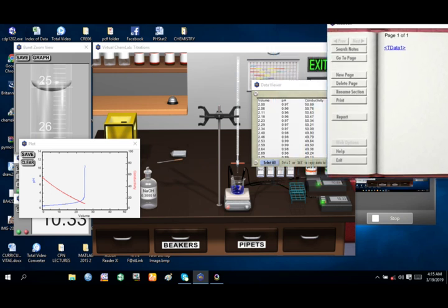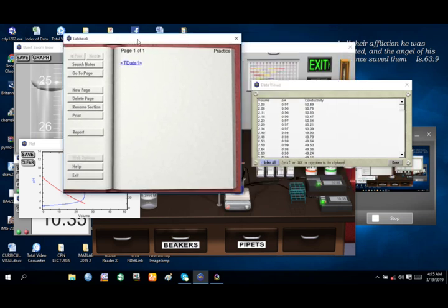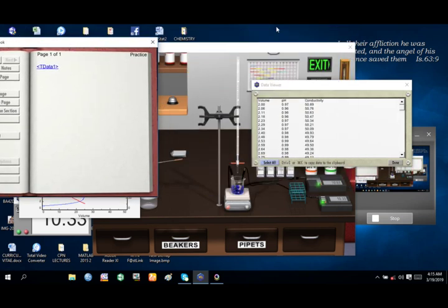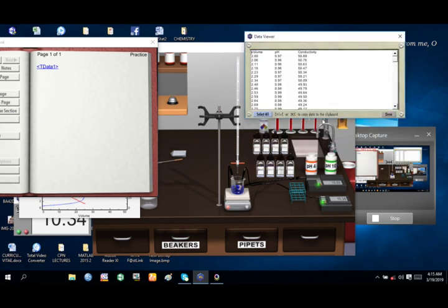You can carry it somewhere in the lab here, where you can dispose of what is left of the titration. So when you look at the lab, you look at where you can drop what you carried out from the experiment.